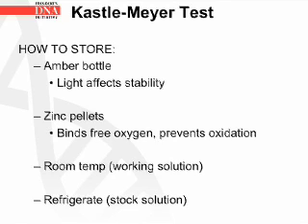The phenolphthalin reagent is stored in an amber bottle. This is because light can affect stability. There are zinc pellets at the bottom of the bottle, and these bind free oxygen and prevent oxidation. The working solution can be kept at room temperature, and the stock solution should be refrigerated.